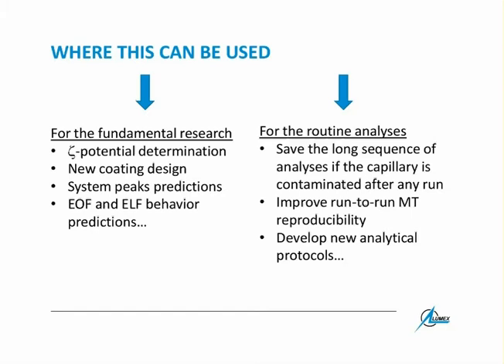That's a very interesting option, actually, I would say. You can inject your sample from either of the capillary ends, from the inlet, from the left side, let's say, or from the outlet, from the right side. Yeah? And you know that the detector point is located in the capillary, not in the middle, but drastically shifted towards the outlet. What does it mean in reality? Imagine you have a capillary of about 30 centimeters length, and the detector point is located just 7 centimeters before the outlet. It means that the capillary is divided into two parts.